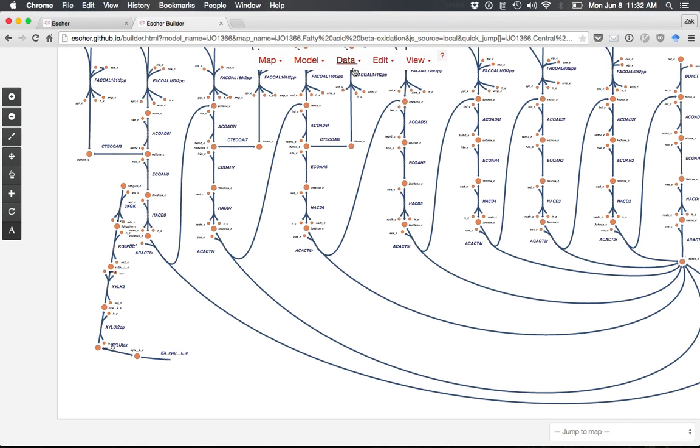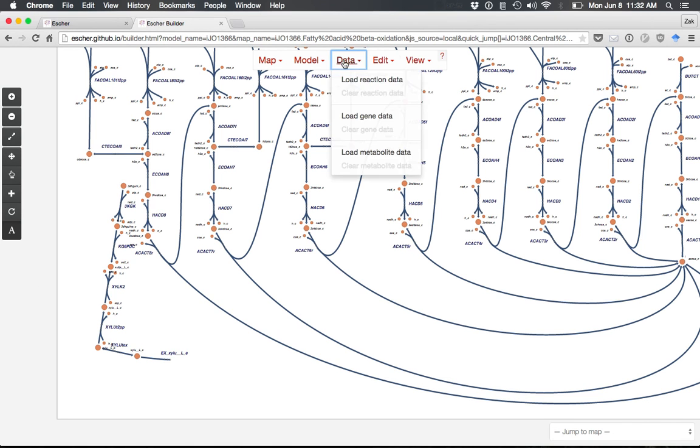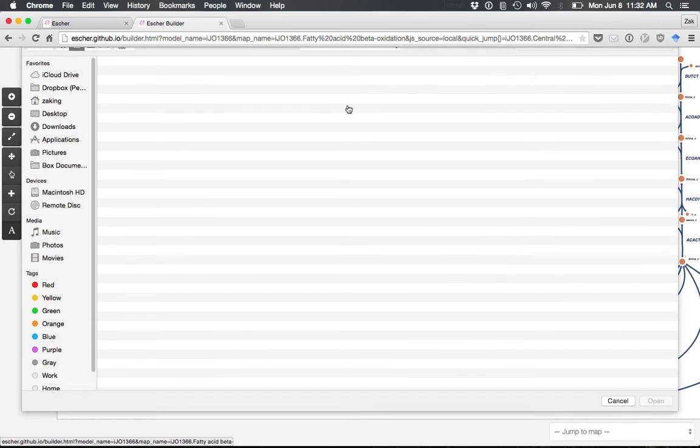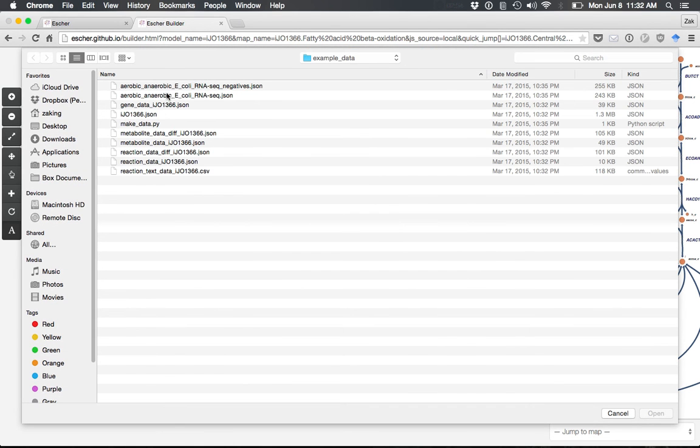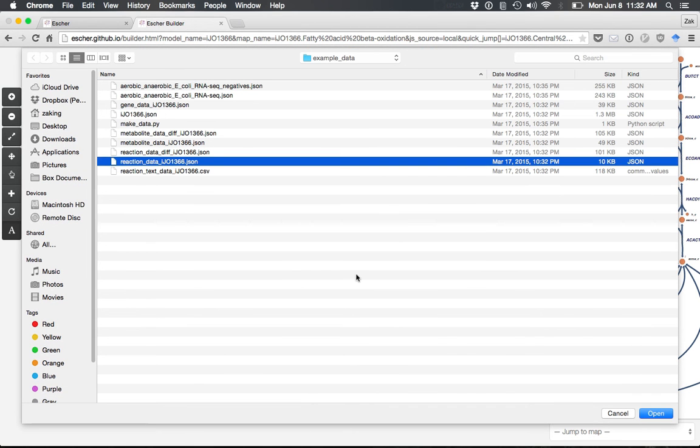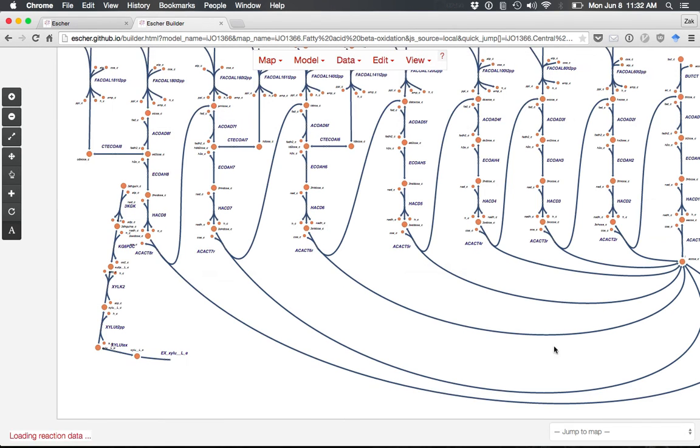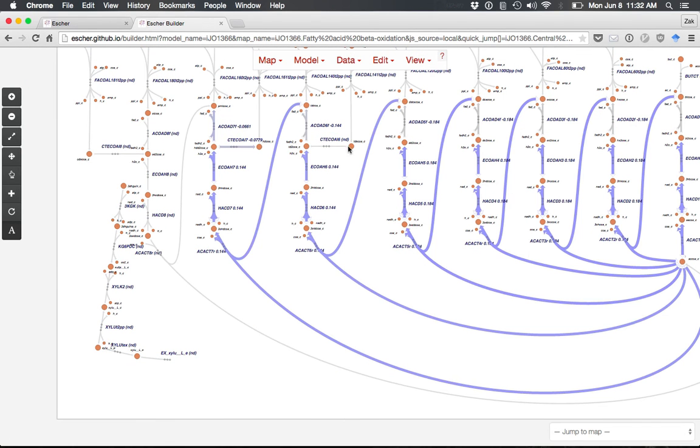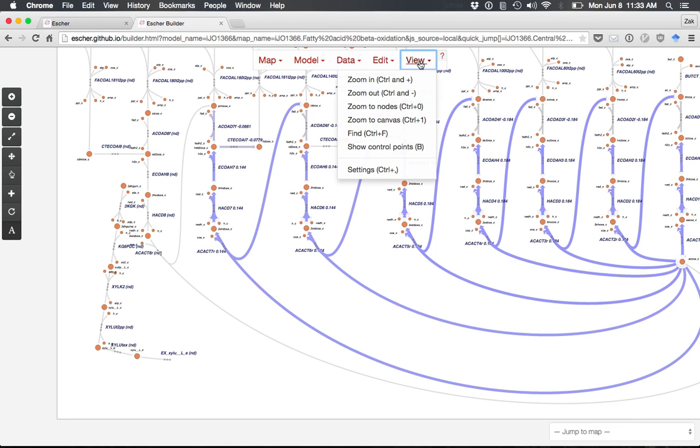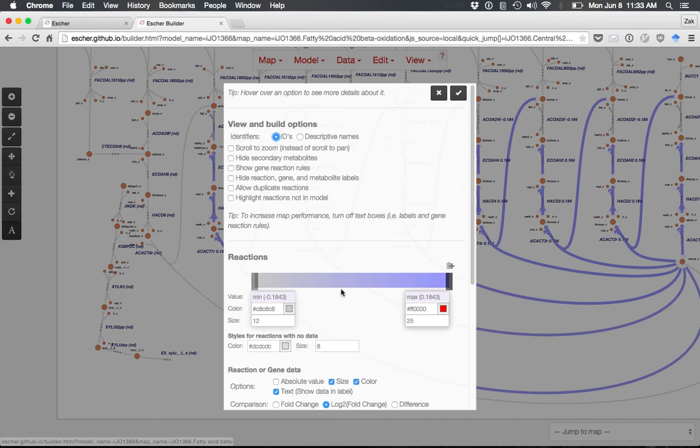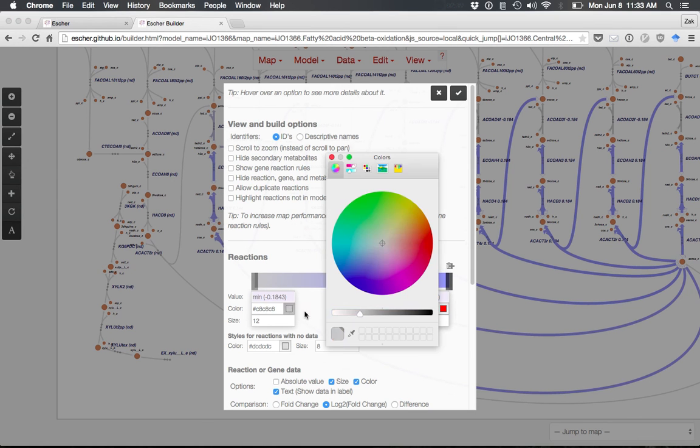Escher is designed to visualize datasets. Go to Data and Load Reaction Data to load an example dataset for reaction data. You'll see the fluxes for those reactions visualized using colors. There's also a detailed settings menu where you can customize colors.